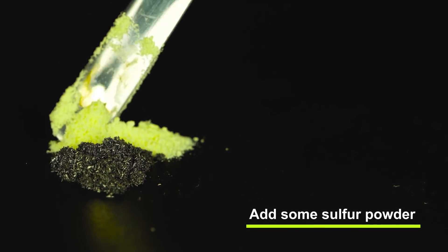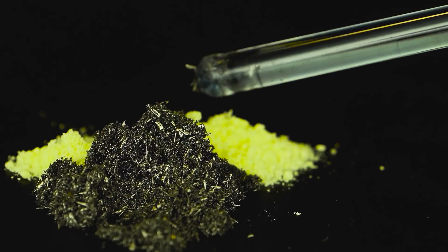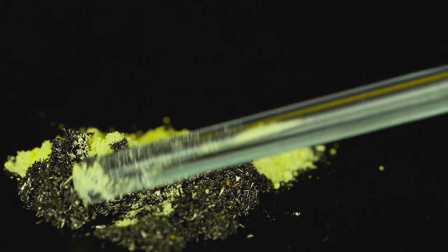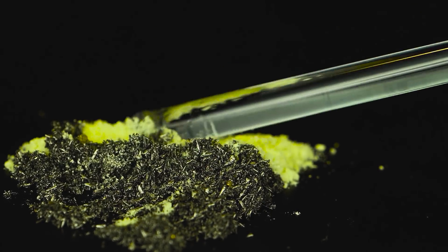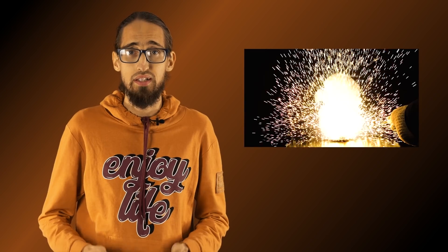Here is a classic reaction with sulfur. There were a lot of reactions of metal powders with potassium superoxide in the last video with your chemical suggestions, so now it's time for metallic samarium powder.